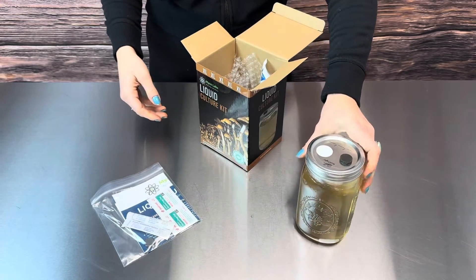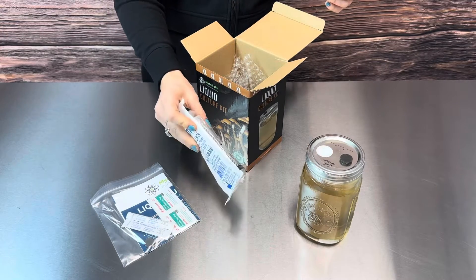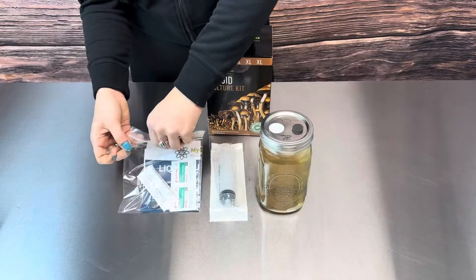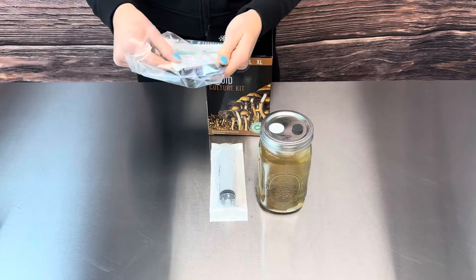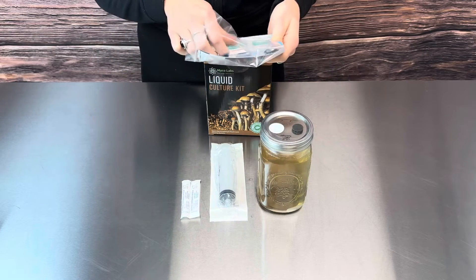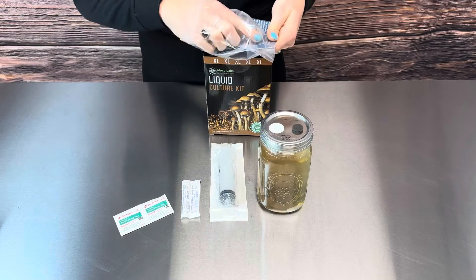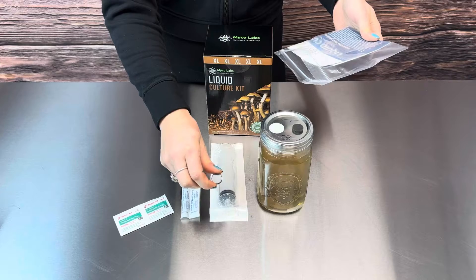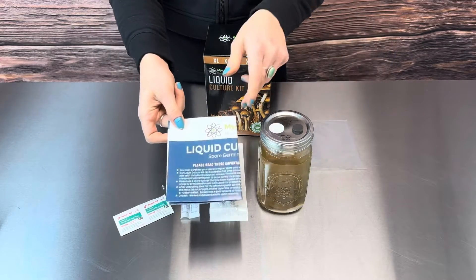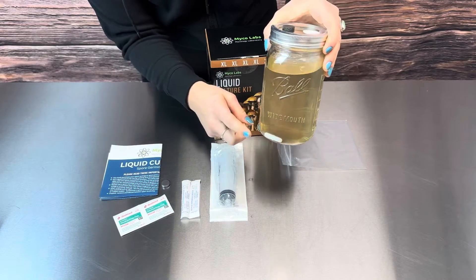You are injecting live mushroom tissue into your substrate, which then colonizes more quickly. This kit includes a 60 cc syringe, and in this bag it also includes two 16 gauge needles, two isopropyl alcohol towelettes, a magnet for stirring, and the directions which have some tips included as well.